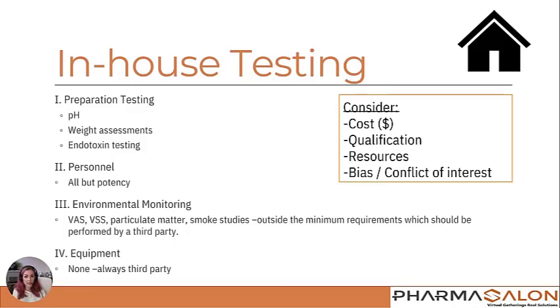And then last, there is potentially a bias or conflict of interest if you're performing your own testing all the time, unless you have, like I said, specific departments that are completely separate from operations that are able to do that in an objective way. So just be thinking about those things. For the most part, that analytical testing is going to be sent to a third party and not performed in-house.